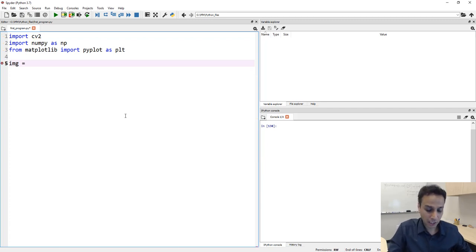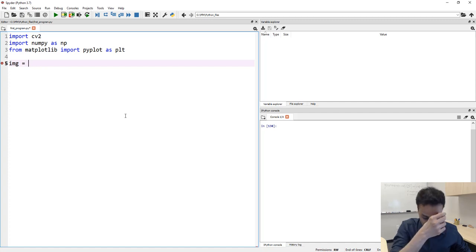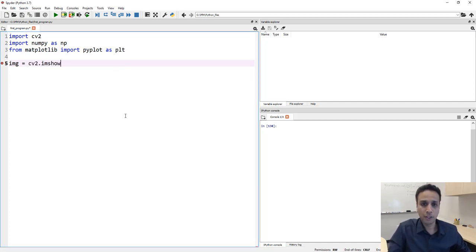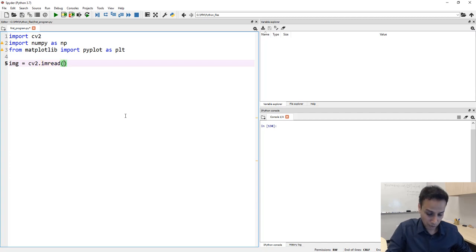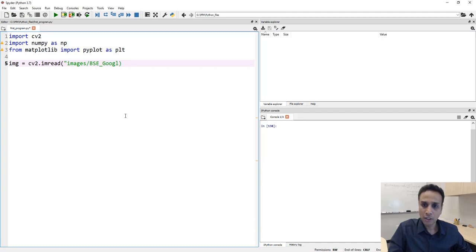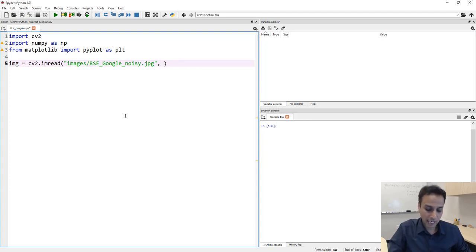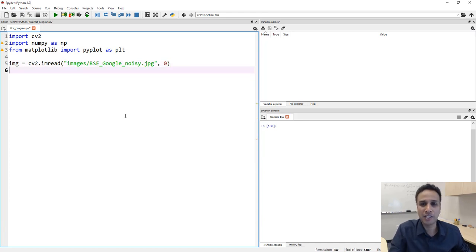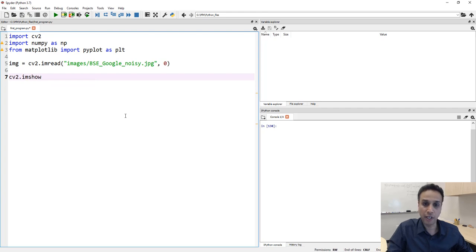Let's start with defining a variable — I'm calling it img. I'm assigning our image array to this variable using cv2.imread, and this is under a folder called images labeled BSE_Google_noisy.jpeg. I want to read this image as a gray level so I'm putting zero there — if I put one that would be a color image. Once I have this image, let's go ahead and look at it with cv2.imshow.